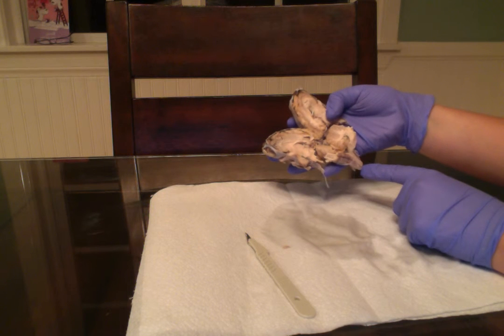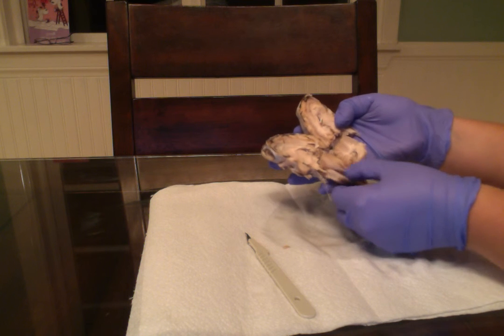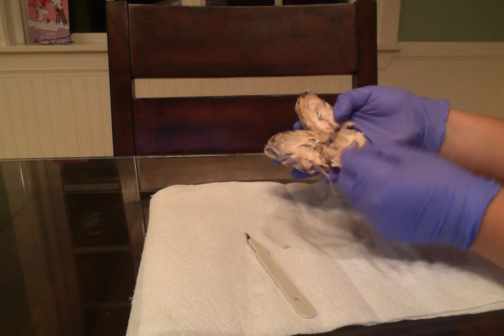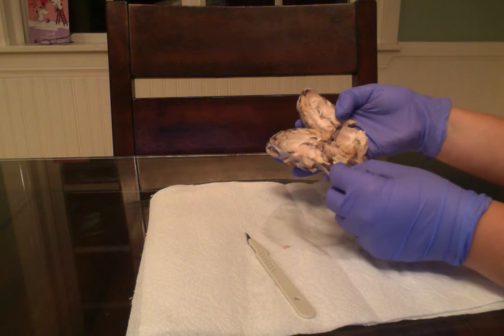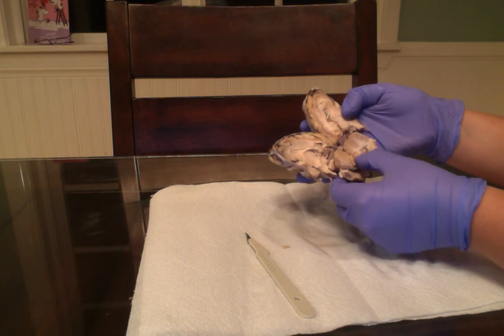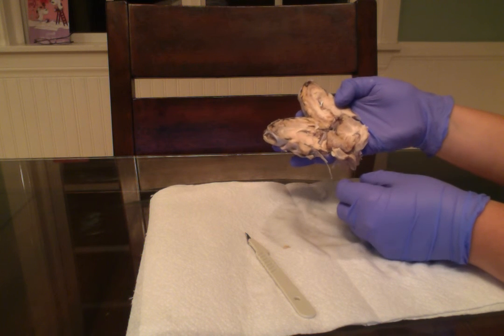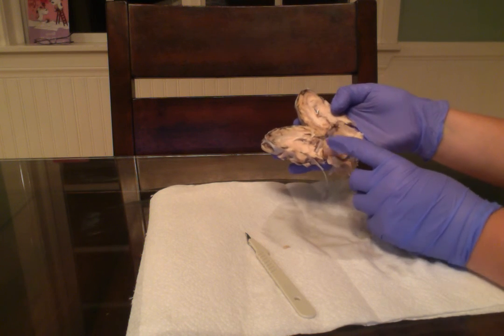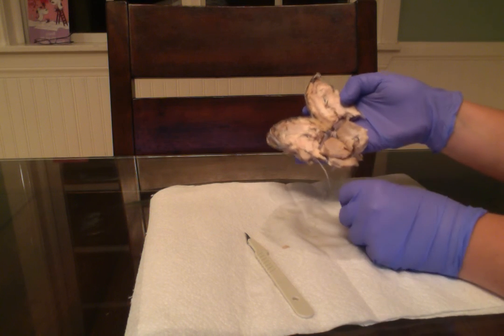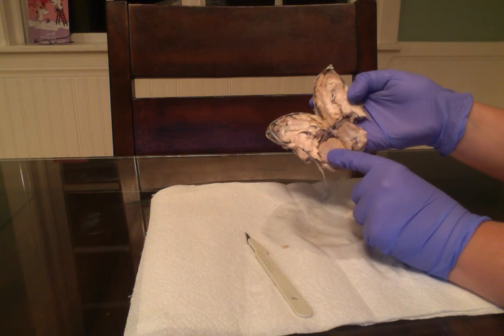Our fourth ventricle is this guy here. And then we have the corpora quadrigemina, and that guy is the two bumps here. We also have the arbor vitae, and the arbor vitae is going to be this branching area here. The arbor vitae is the white matter in the cerebellum that resembles a branching tree, so you can see how it looks like we got two trees here.